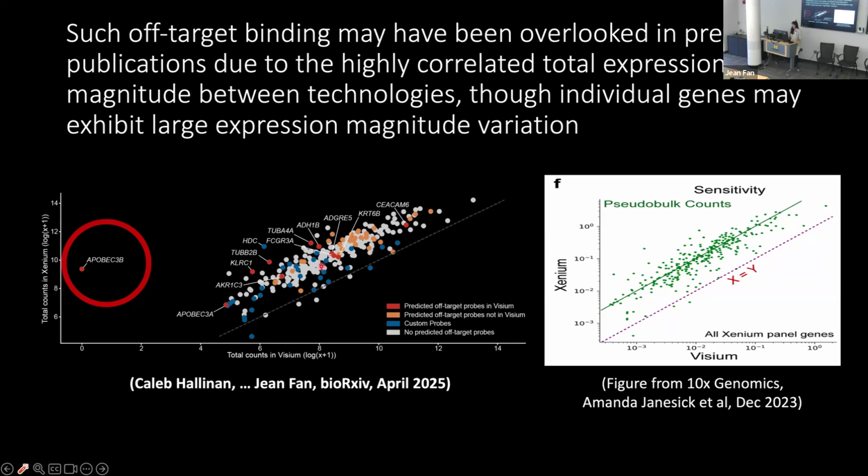The reason for this particular visualization is simply to highlight the consistency and the inconsistency with the publication. We have tried looking at the correlation or cosine similarity in space. It turns out there are a couple of challenges with that metric.